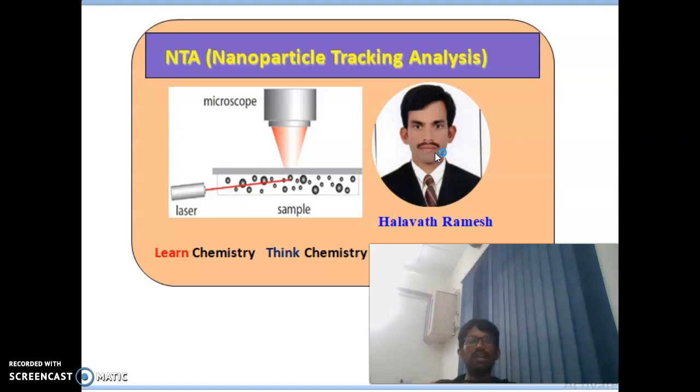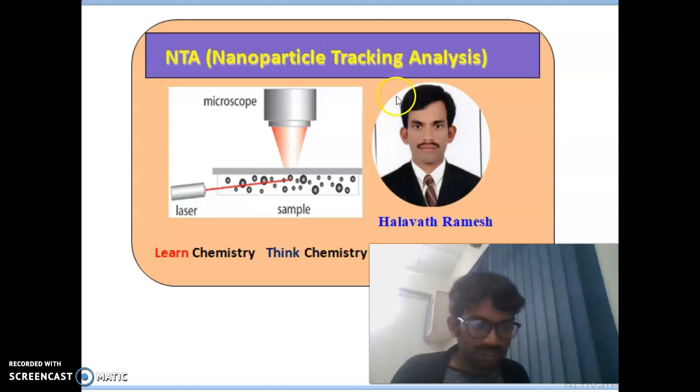And especially biological researchers use nanoparticle tracking analysis to see how the particles are moving in the solution, and what the particle size is depending on time, how the size is increasing or compressing again. Those studies are especially done using nanoparticle tracking analysis. We can understand it clearly. Mostly people use nanoparticle tracking analysis for the measurement of biological samples.